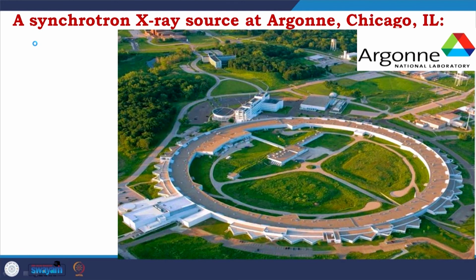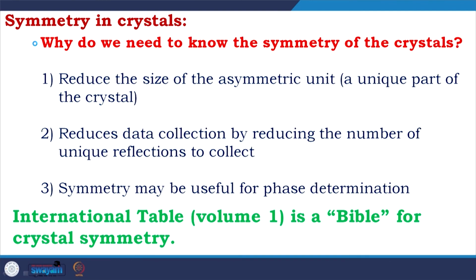I talked about, remember, that a synchrotron beam is like covering a tiny town. This is Argonne National Laboratory. I did my PhD at the University of Illinois, Chicago. We used to go there, and as you see, this beam is covering the whole small town.